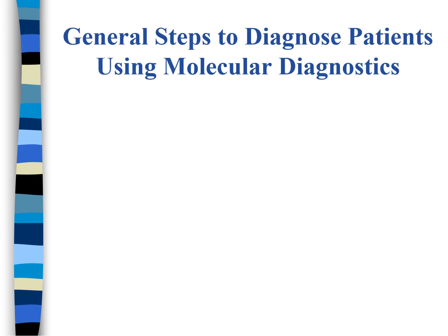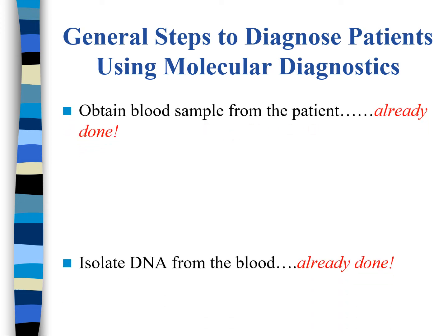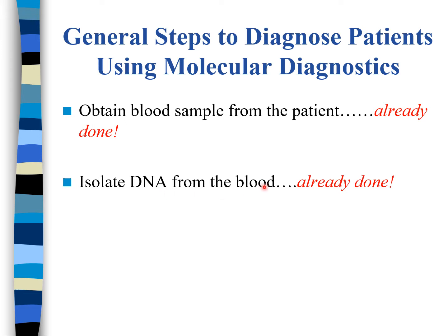As I said, this experiment is a continuation of last week's experiment. Let's say we got the DNA from the patients. We got the purified DNA, and we want to determine which patient or patients have the CML type of leukemia. So we got the blood sample, we isolated DNA from blood using that kit we talked about, and we have pure DNA from each patient.